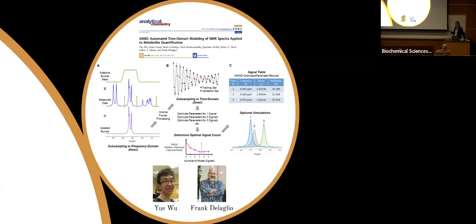We love the tabular domain right now, because the number of points is the number of peaks that are in the spectrum. We have the frequency, the decay, and the amplitude. We would have the phase if we didn't just set the phase to 0, but those are the parameters that we get out of a SAND analysis.